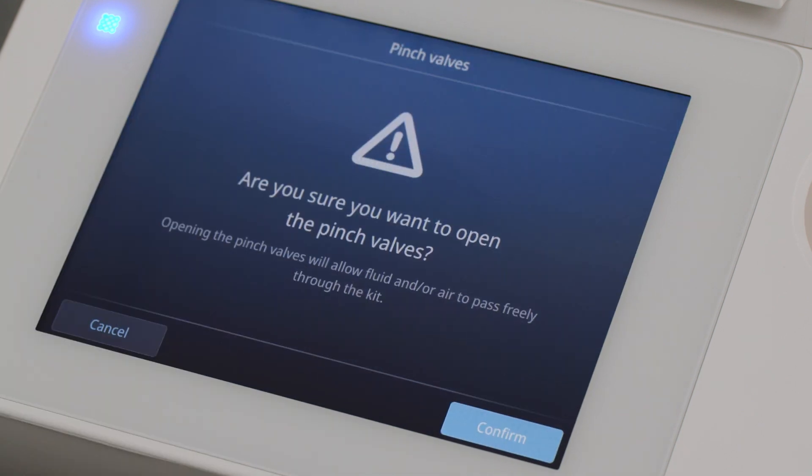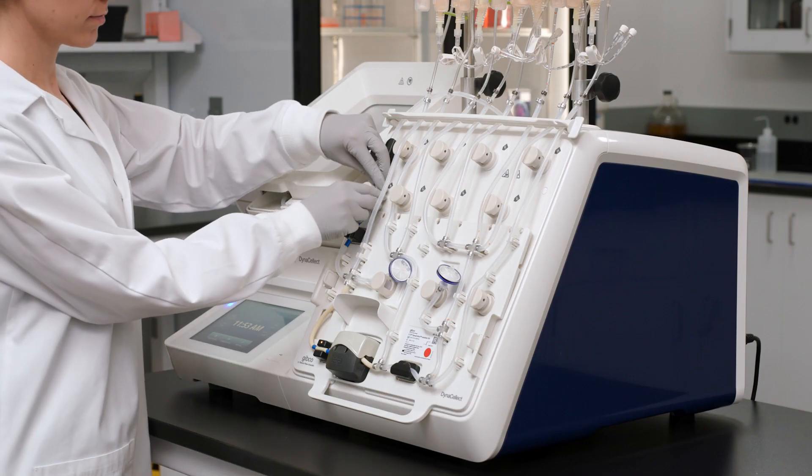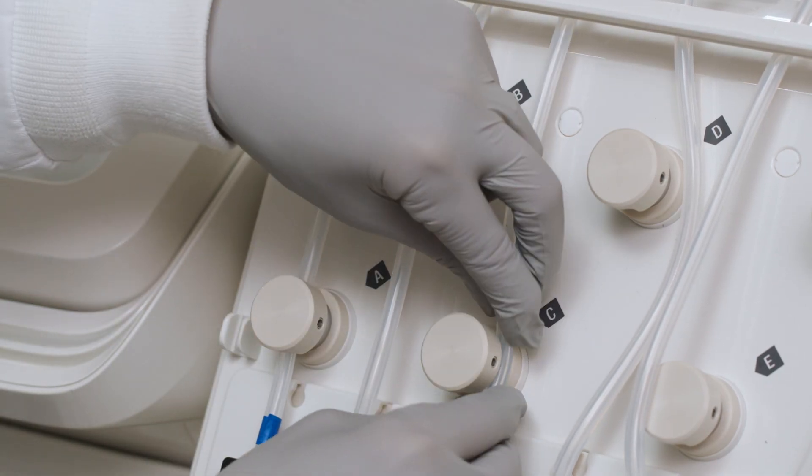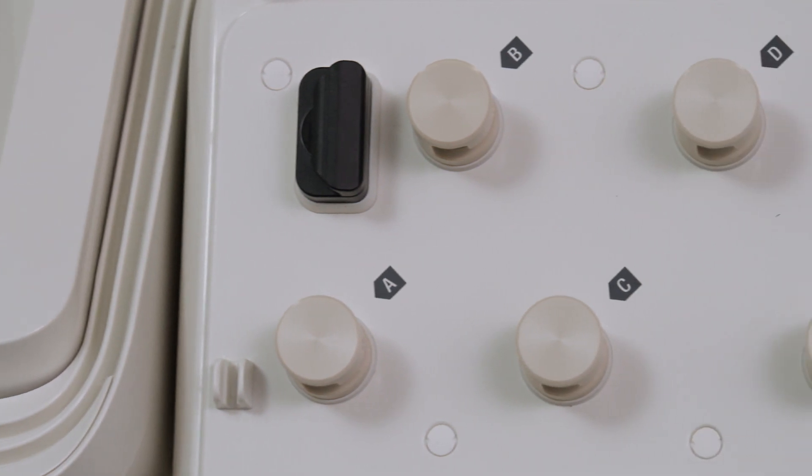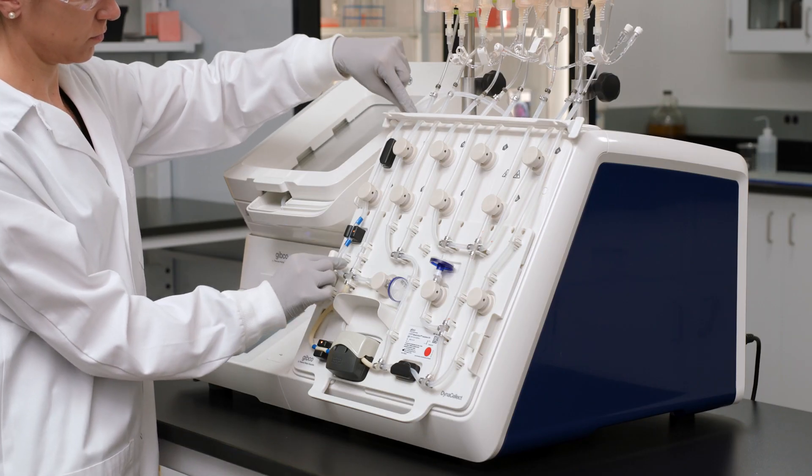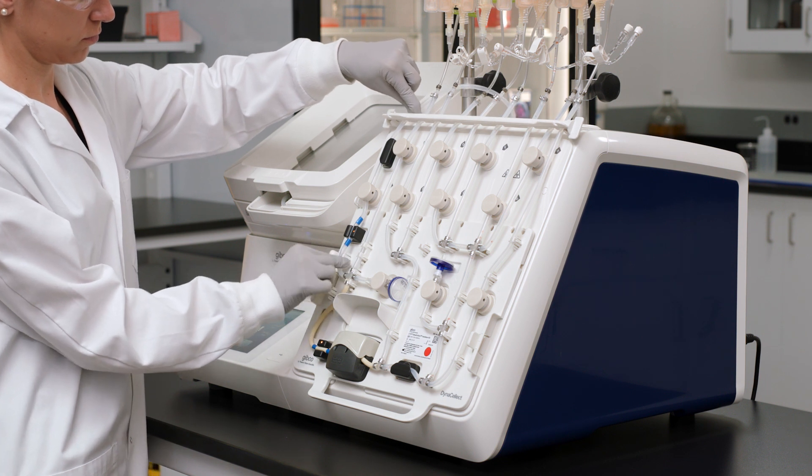From the touch screen, open the pinch valves, then install the tubes into all the pinch valves. The pinch valves, cassette, and tube holders have letters to ensure the correct placement of tubing. When all the tubes are installed, straighten the tubes and close the pinch valves.